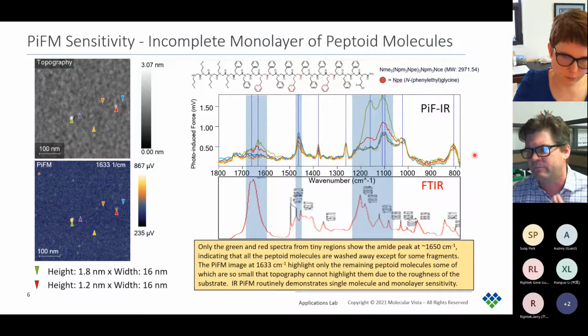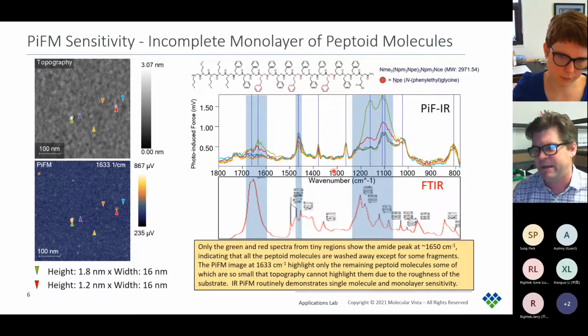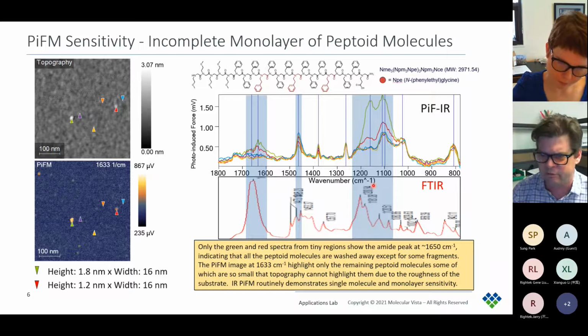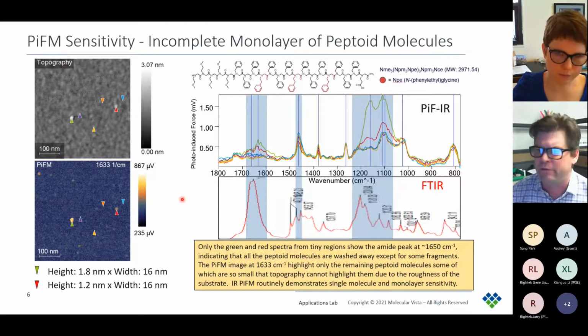So we have some siloxane-based contaminant, we have some plasticizer-based contaminant, and apparently these were part of the process in making the samples. So not only were we seeing the molecules themselves that they're interested in, we were also seeing artifacts from the sample creation, these pre-processing events where we might have been using siloxanes or other plasticizers. So really powerful and eye-opening for that research group.